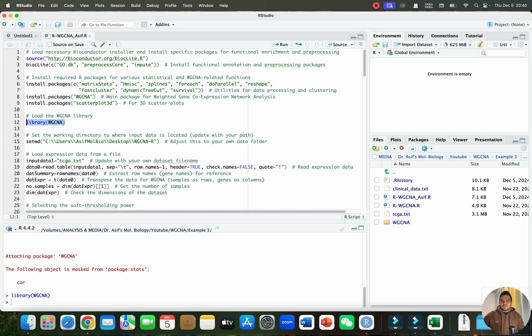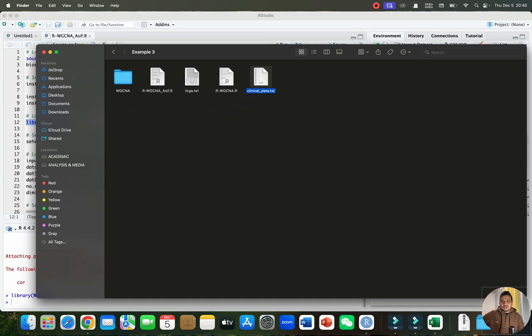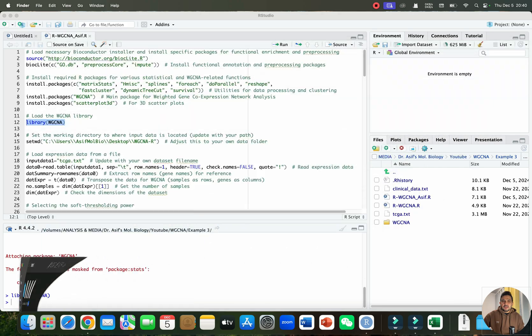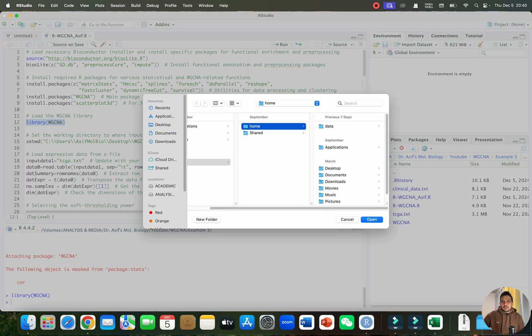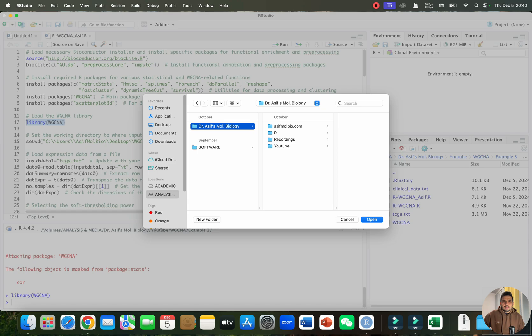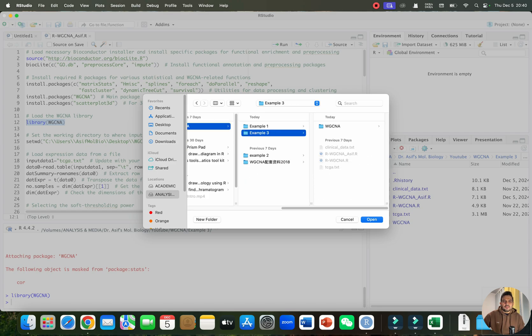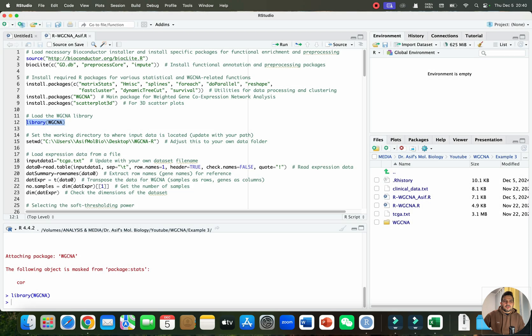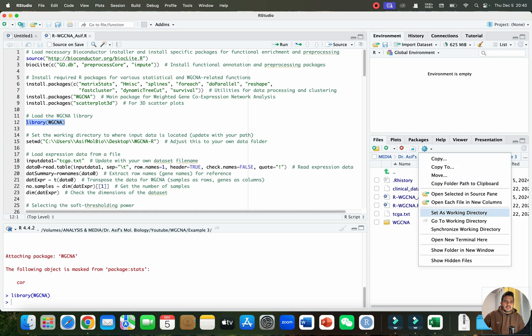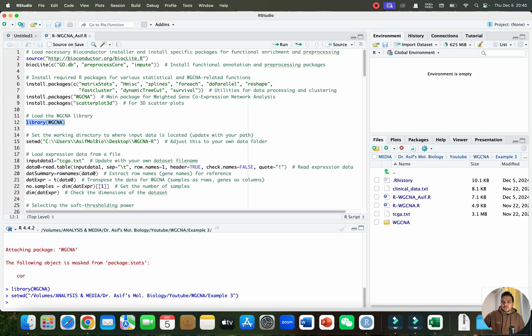The next step is to set the working directory, since all follow-up output files will be saved there. We can click the three dots in the Files pane, navigate to the WGCNA folder — example number three — and then click the dot menu and select 'Set as Working Directory'. You can see it has automatically written the code and our working directory is now set to that folder.